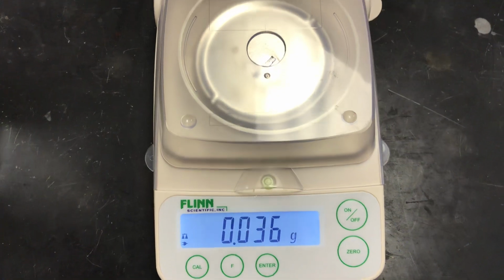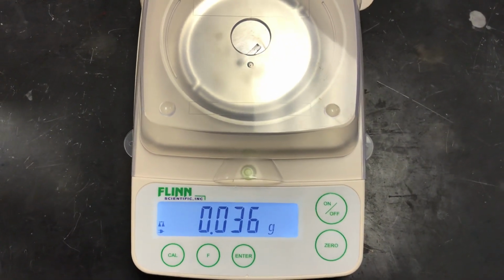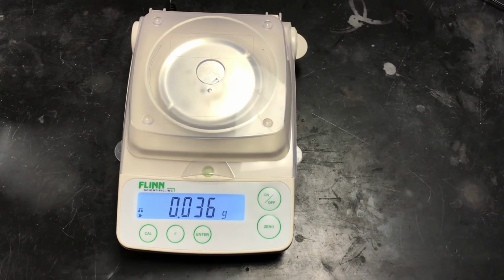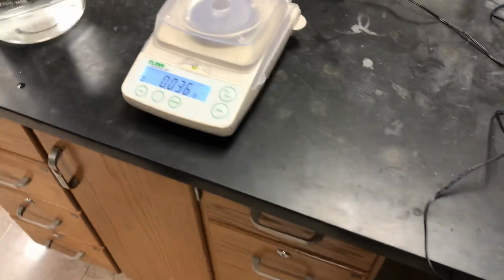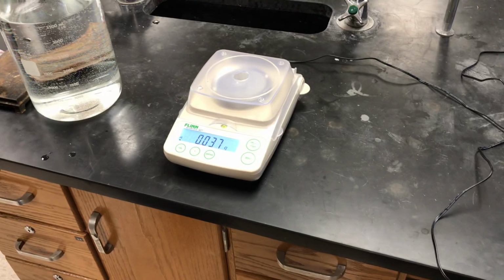Trying to make up its mind. It's sensitive enough that air currents can cause it to jump around, that's why this lid is here. Looks like it's happy now. It's like 0.036 grams of magnesium.